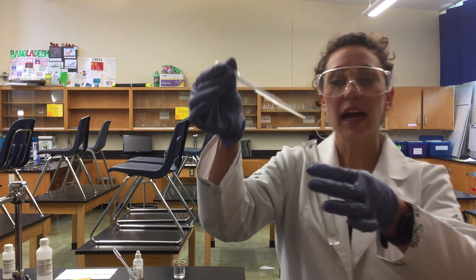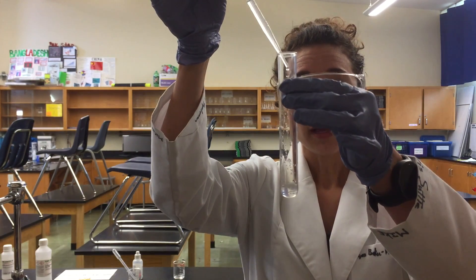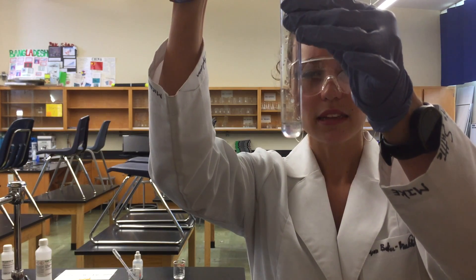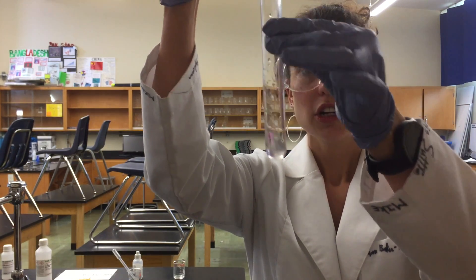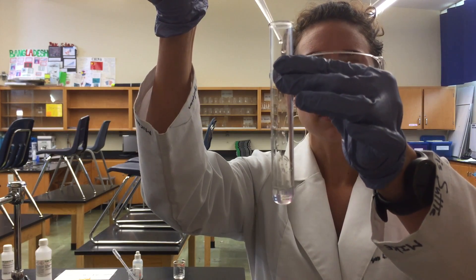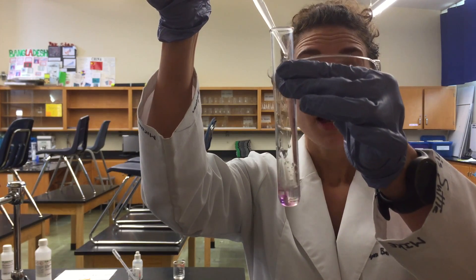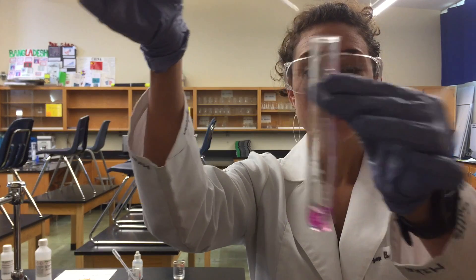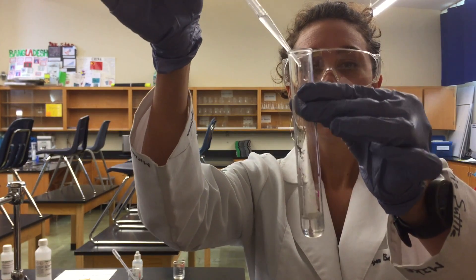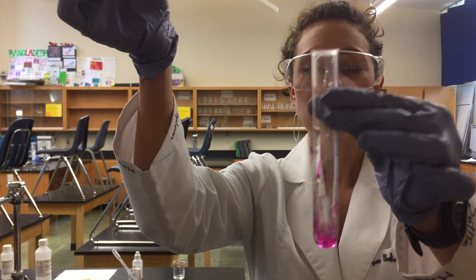Drop by drop I'm going to add some of our other reactant, sodium hydroxide, to see what will happen. You can see that in an instant the phenolphthalein indicator starts to change pink, but then if you mix it, it goes away because there's still more acid than base. Eventually we'll have so much base that the solution will stay pink, and we are doing this drop by drop to see where that sweet spot is.